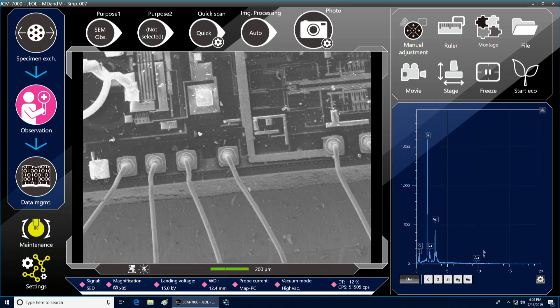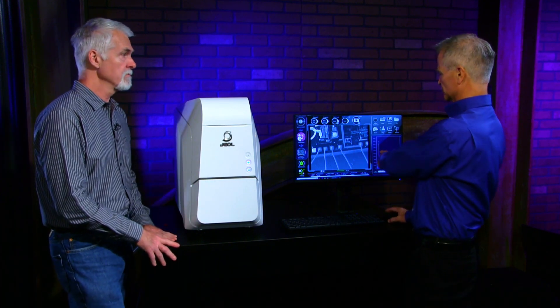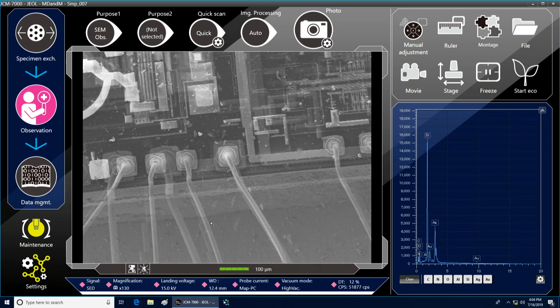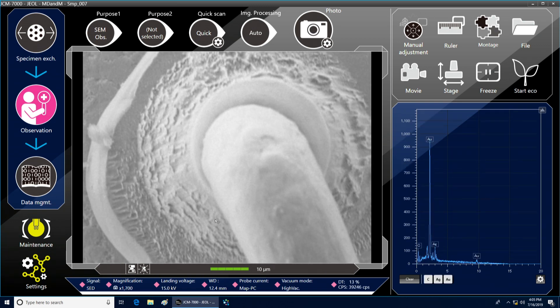Another item here is live analysis. We have the elements displayed on screen live as we scroll in. The elements across that particular field of view are displayed. Right now I have more silicon than gold, but as I zoom in on this gold pad, you'll see that the live analysis screen changes and it pretty much fills the entire view with gold, and now you can see that gold is being displayed.